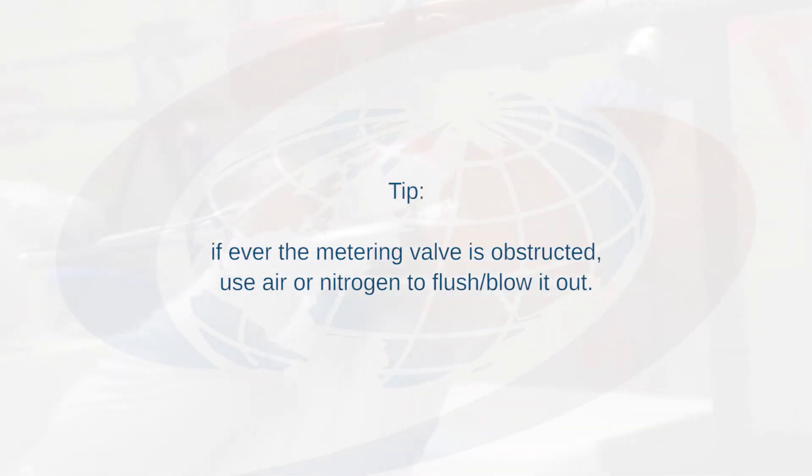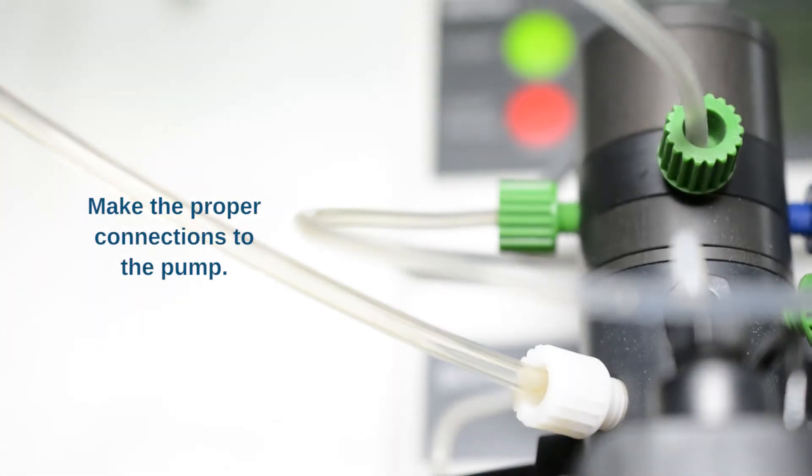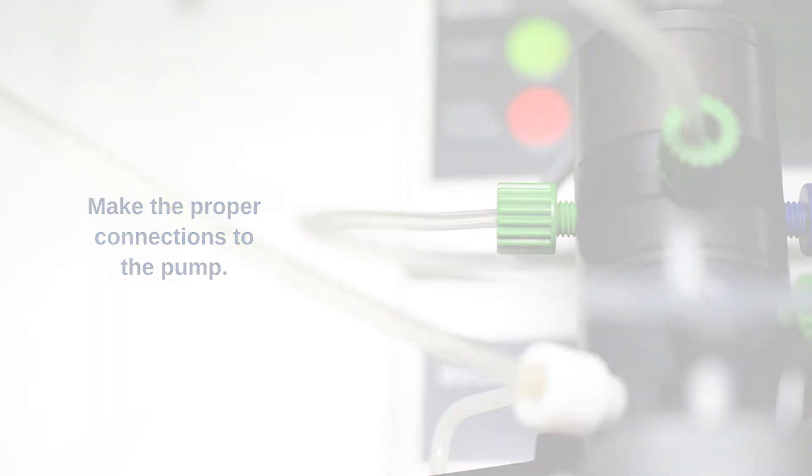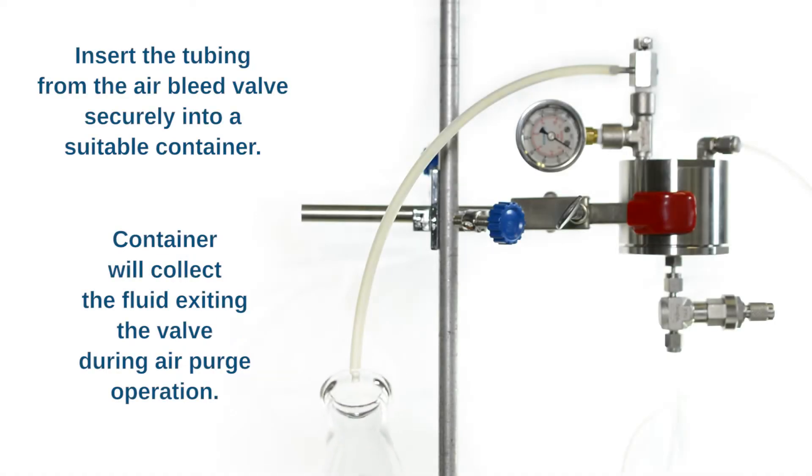If ever the metering valve is obstructed, use air or nitrogen to flush or blow it out. Make the proper connections to pump. Insert the tubing from the air bleed valve securely into a suitable container. Container will collect the fluid exiting the valve during the air purging.